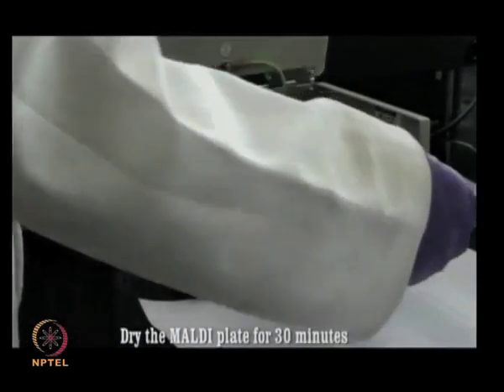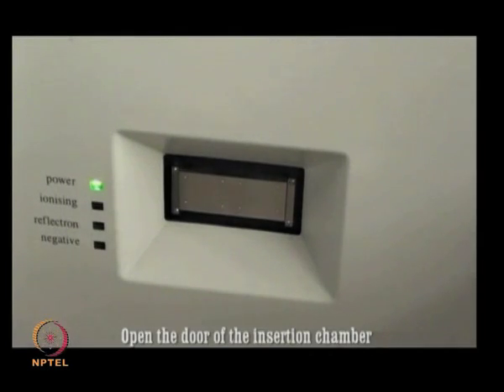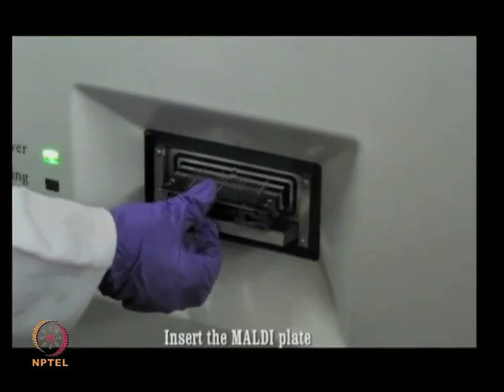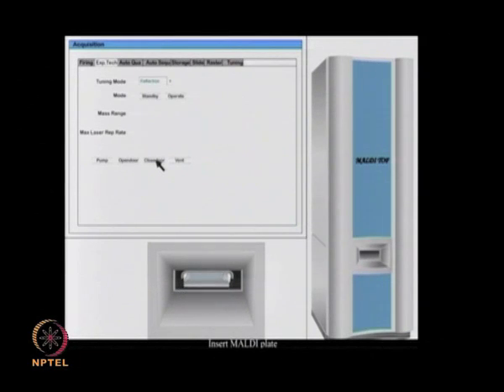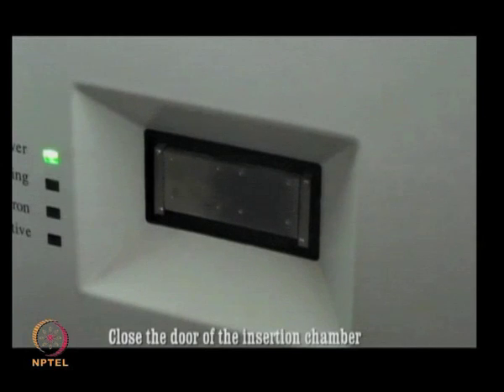While these steps are happening, you need to ensure that the instrument is on. So, click on the software and open the acquisition window, and then click on open door. Insert the MALDI target plate, face up with the cutoff corner to the front, and now by using the software, close the door. The door of the insertion chamber is now closed.